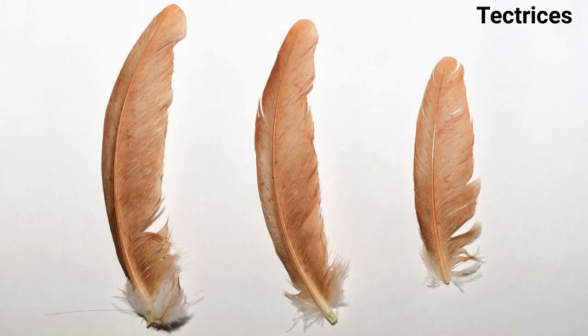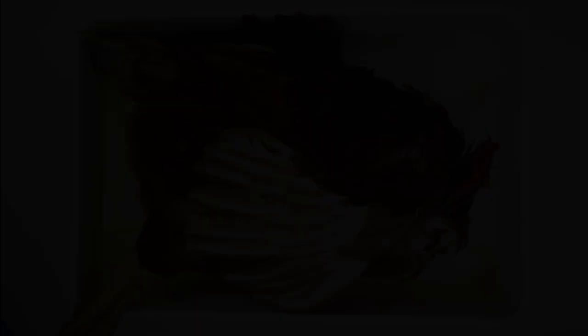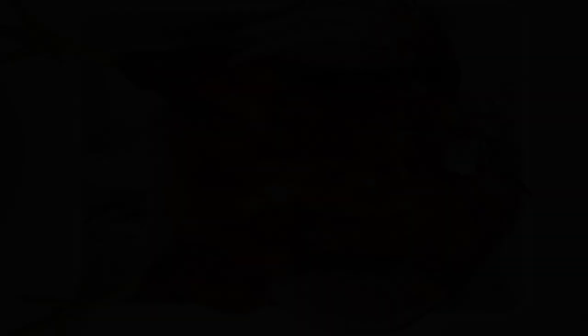The body is covered in two types of feathers. The surface has larger, stiff, cover or contour feathers, while beneath it lie crinkled small soft down feathers. The specimen is now placed in a dissecting dish and the feathers are plucked until the abdominal area is completely free of feathers and ready for preparation.